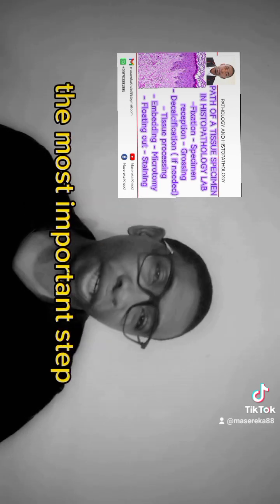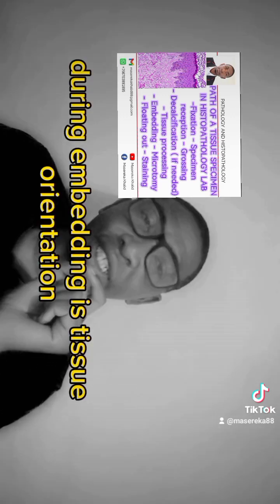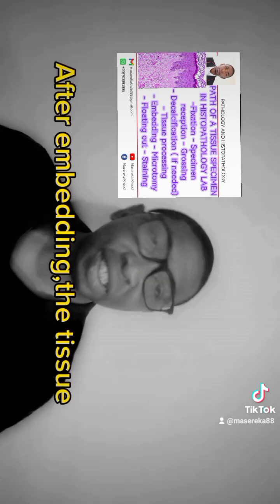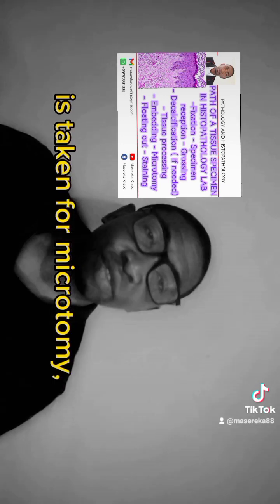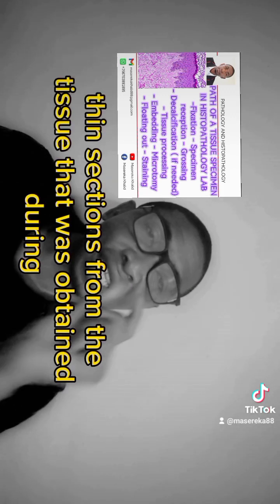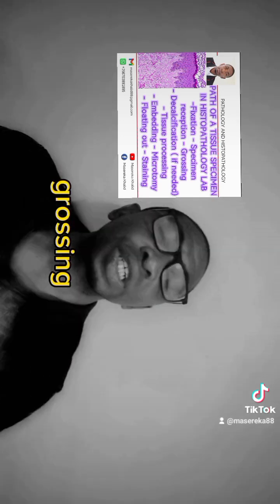However, the most important step during embedding is tissue orientation, as we shall have an insight in our subsequent discussions. After embedding, the tissue is taken for microtomy. And during microtomy, we are aiming at producing thin sections from the tissue that was obtained during grossing.